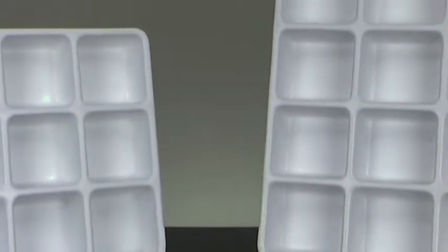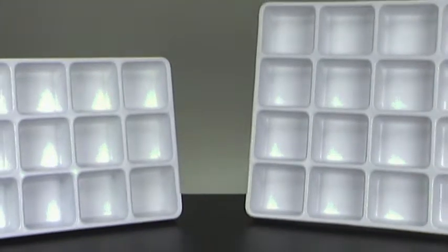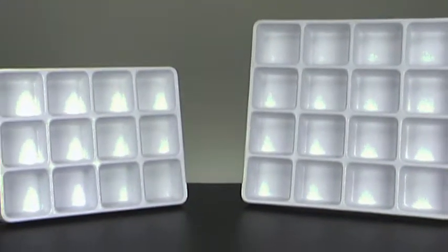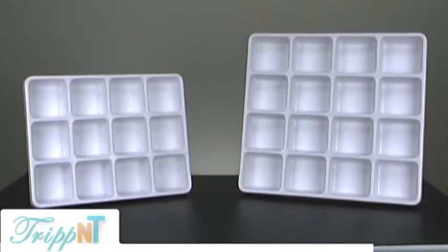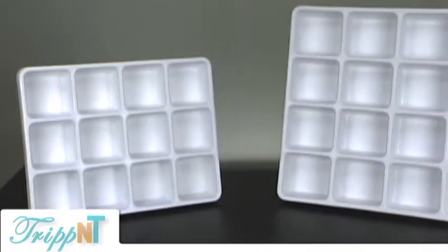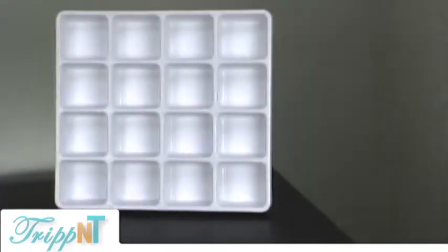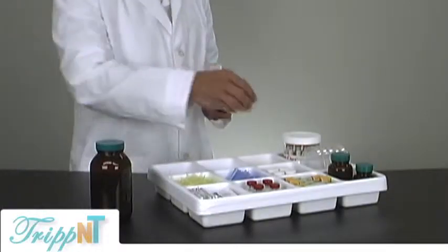Hello, this is Susan Tripp, and today we're featuring the Stopper Organizer, or tray. Tripp NT trays are made from 1/8-inch white high-impact styrene. They're very tough, durable, and rigid, so they can be used either for just storage or as a tray to carry supplies from one place to another.